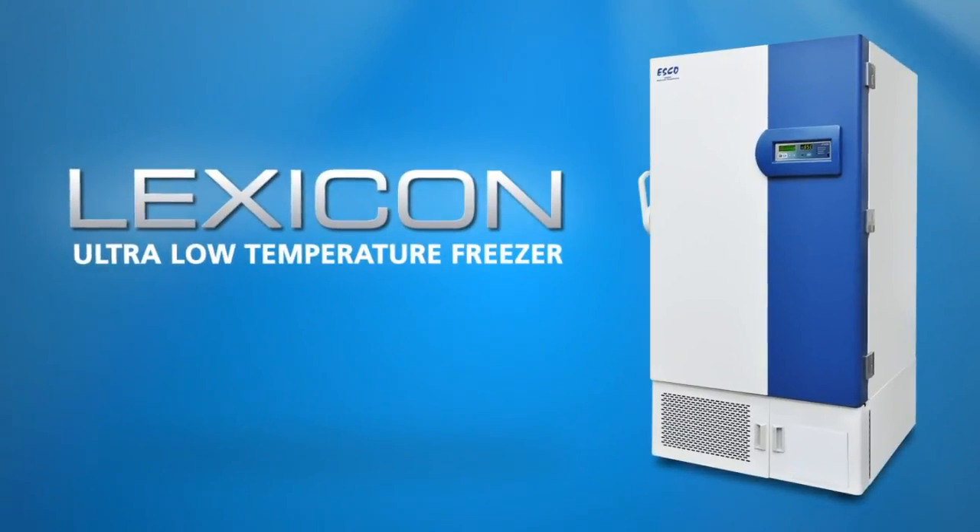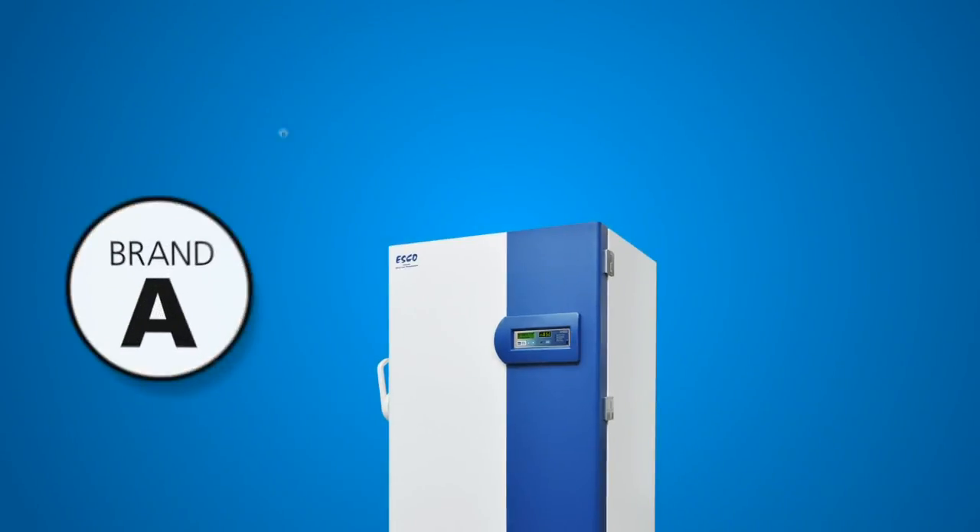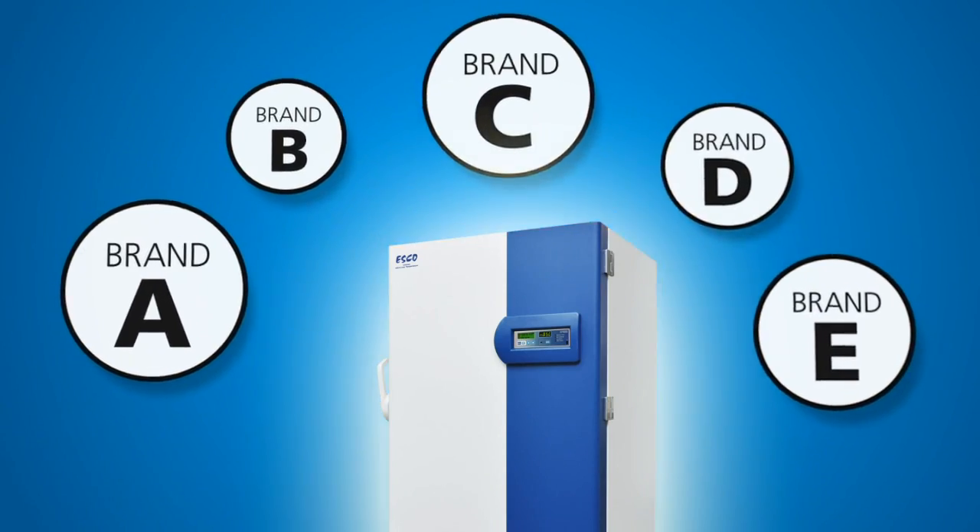Hi! My name is Lexicon. You can call me Lex for short. Think I'm just another ultra-low temp freezer? Well, think again.